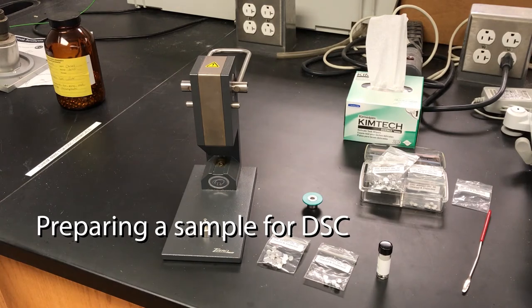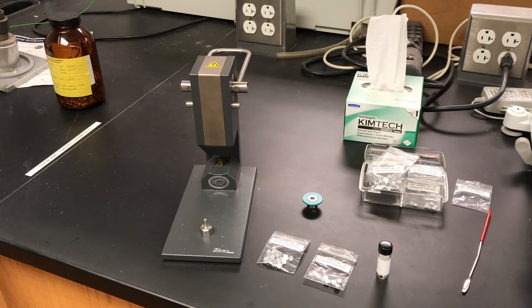So in order to run your samples on the DSC, you have to put the samples in some sample pans and press the pan and lid together.